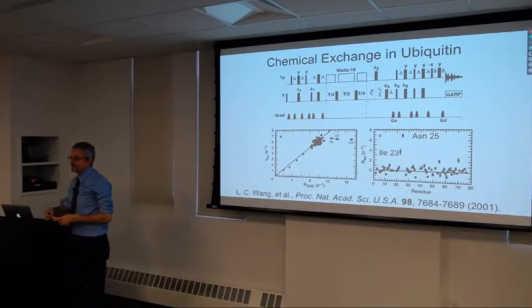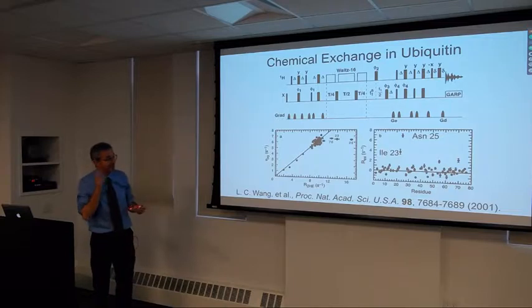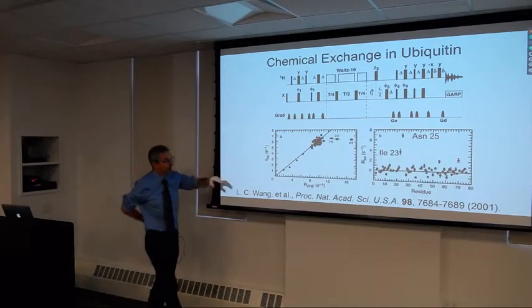So Waltz is a very highly compensated decoupling sequence. It's highly compensated against B1 inhomogeneity, against resonance offset, but only if you have a full supercycle. So you can't have parts. So that limits the values of capital T. You have to be able to fit a full cycle of Waltz into T over 4. Most of the time that's not a big problem. One just has to be aware of it.